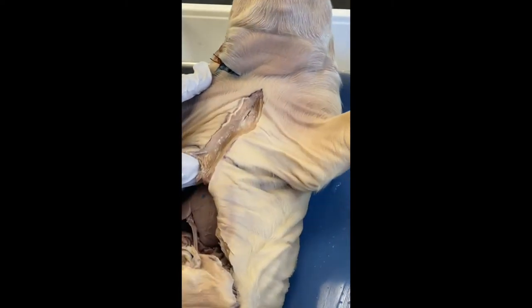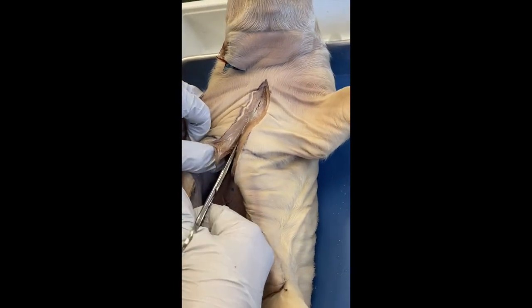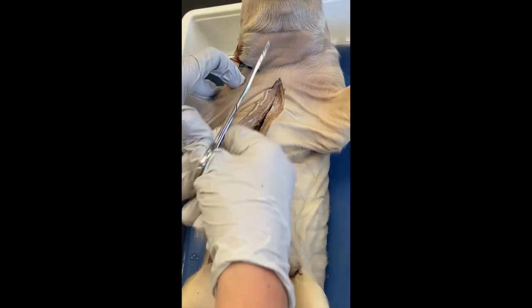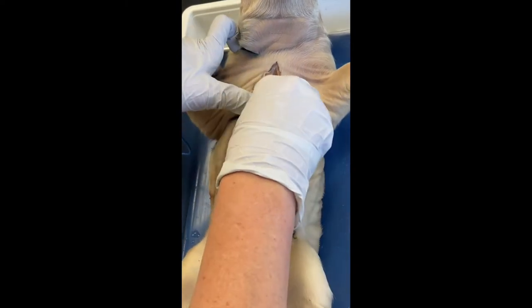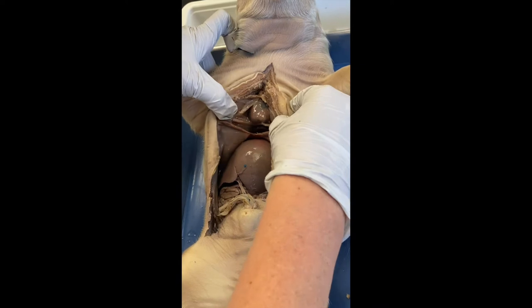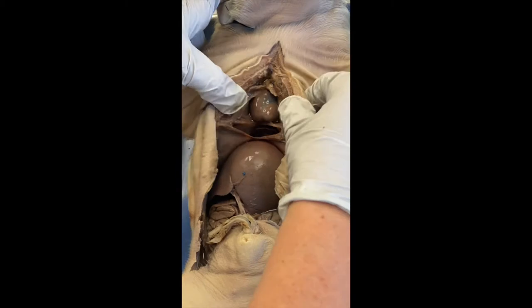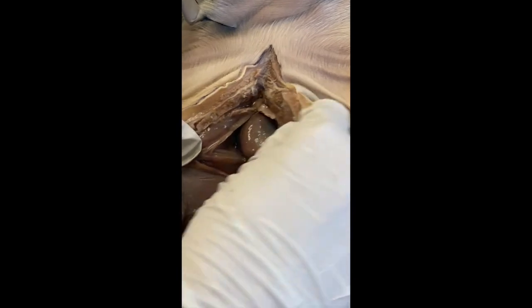At this point, I might need my scissors. I put them back in the thing. Oh, you got it. Again, gonna cut this chest plate. And that is some bone there. Let's see if I did a good enough job here to get the breastplate open. I did, but guess what I did do? I just realized, and I'll show you guys that. I cut the sac around the heart. There's actually a clear sac around the heart, or maybe I did, we'll see. I'll show you in a moment.